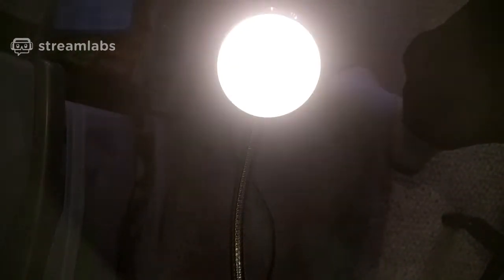Here's my light source. This is another way I love to look at samples. It's just a regular light, but it's a gooseneck lamp, and I just have it hanging in a way so that I can look at it quite easily. Alright, so now let's look at this sample.